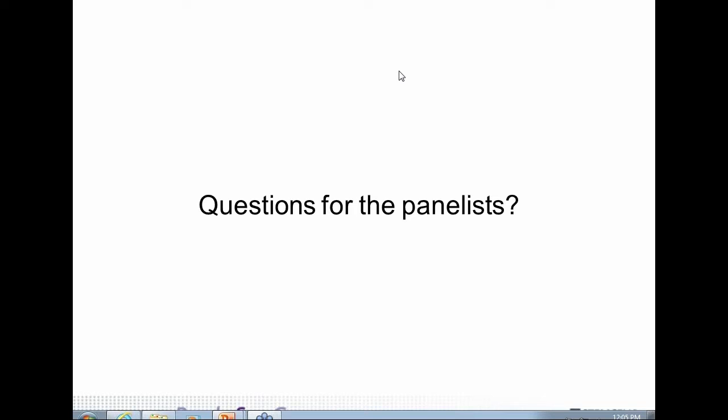Yeah, and someone's just asked, aren't dead cells eliminated with positive selection? But my guess from your answer is that no, because they still express the markers that you're using to select the cells. Is that right? Yes, that's correct. Okay. And Kurt, what issues do you have with any older samples? Is it viability as well?